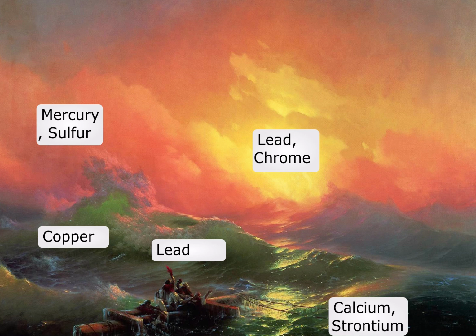Lead white is very often used, and then our black here has both calcium and strontium. This would indicate it's bone black. Just for fun, if you look at a periodic table, look for strontium. Its elemental symbol is Sr. You'll notice it's just below calcium. They have the same outer electron structure, and as a consequence, they tend to fractionate together whenever any kind of chemical reaction takes place. So your bones, your teeth, which are primarily made of apatite, calcium phosphate, you'll have a large quantity of strontium present as well, just because it's hitchhiking along with the chemical selection process that goes for calcium.